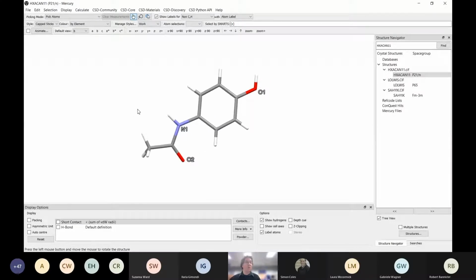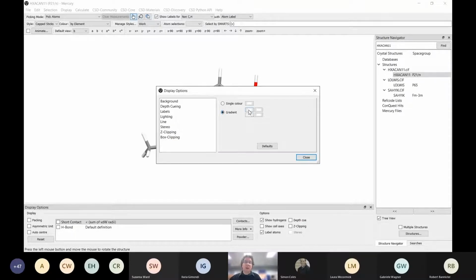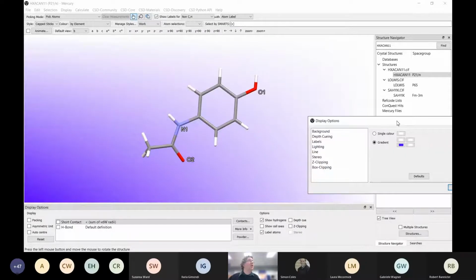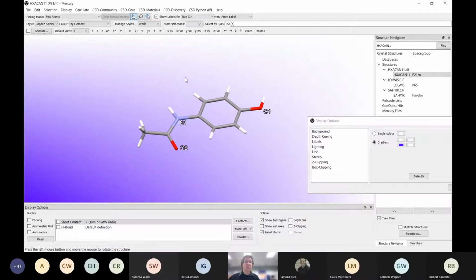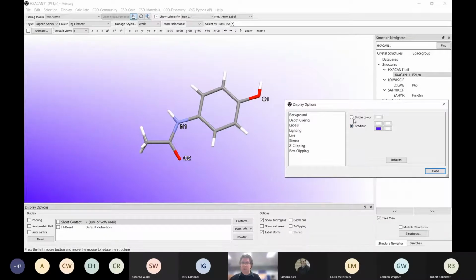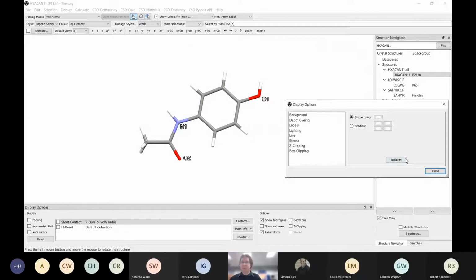This is for if you're doing reports. If you've got to do a presentation where you're visually showing it, so you're doing a PowerPoint, and you want to really highlight something, I have to say sometimes the gradient options can help. Just by doing the graded shading, you can play around with them, and it often seems to make the molecule stand out much more visually than just having a plain background. It's a bit more computational, and as I say, it sometimes slows my display, so I don't want to have it all the time. I'll go back to single color, but sometimes it might be nice to have that shaded background on a picture just to highlight the structure you want. Okay, so on single color and close.